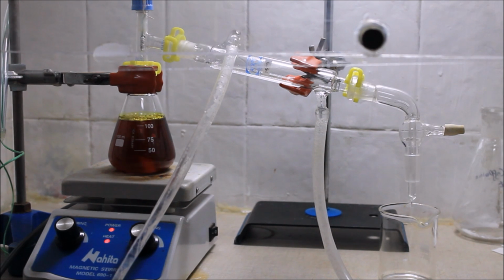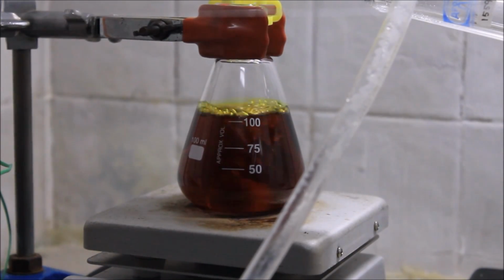The majority of the solvent was removed using a simple distillation. The general setup looks like this. Here you have a time lapse on how the solvent boils out of the solution. The whole process took about 2 hours.